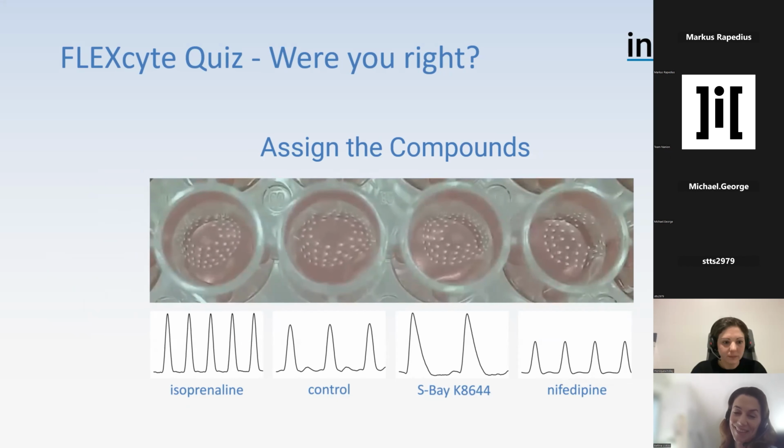I have one hand and one question written. Maybe I read first, and then Marcus, I let you sign in. So from Puya, I hope I pronounced that correctly: to evaluate the drug-induced changes in cardiomyocytes, the patch clamp technique can measure the cardiac action potential and all the individual ion channel currents. Then how would the measurement of cardiac contractility be important for preclinical drug toxicity screening?